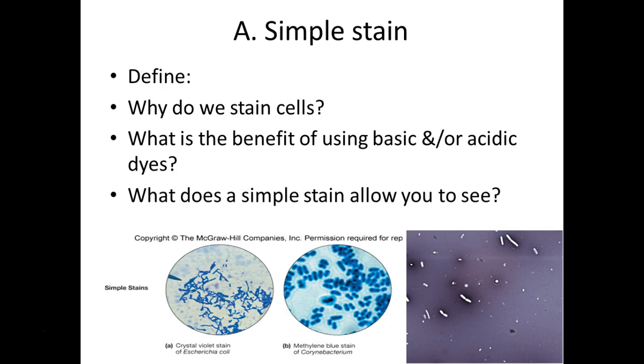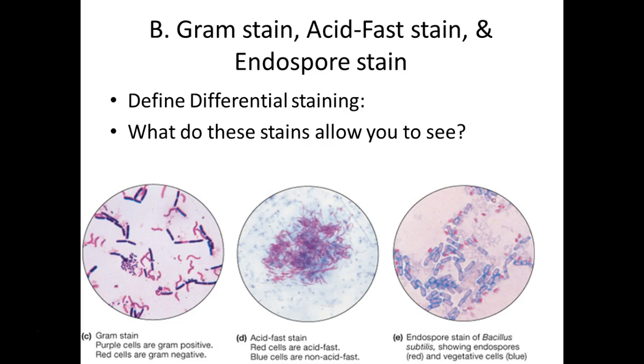Again, you know, these are important things, right? Being able to describe what you're looking at, draw what you're looking at, right? Communicate that in some way that the people that you're talking to are going to understand you. But these are important because do all bacteria have this shape? No, some have different shapes, and this is an arrangement. Notice these are actually two right next to each other. This is what we call diplo, right? Two, or pairs. And that's important because some of them always characteristically form these pairs. Or in the case of streptococci, they always form those chains. And this helps in identifying an organism if you don't know what it is.